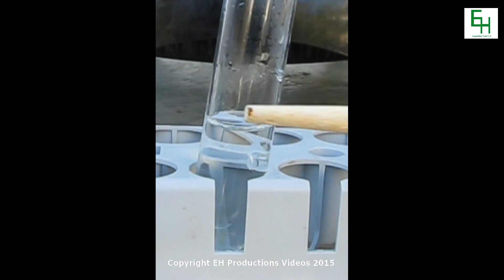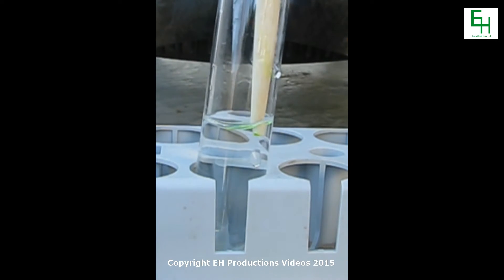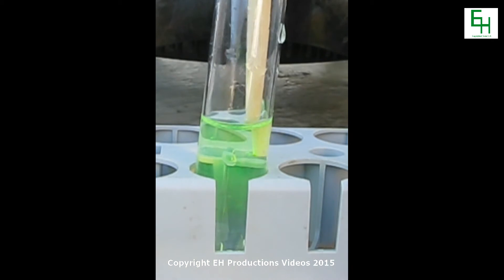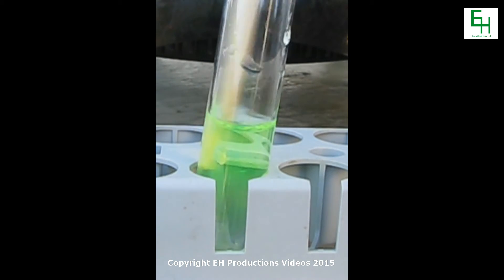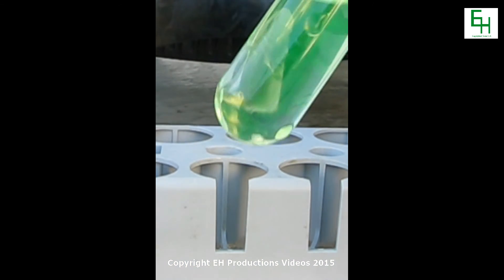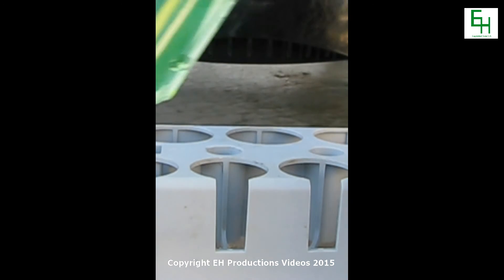I'm going to put it in this test tube full of water so we can see how strong this dye is. Here we go. As you can see, even just that tiny bit is really strong — the color of the water changed into a fluorescent green color. Pretty awesome.